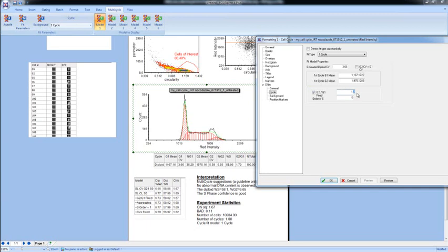We can empirically determine that using a value of 1.6 here, which is what we've done for this data set, results in the best model for this particular data. So this is just something that we put in there to make this data fit a little bit better. You can see how easy it is to actually come in and make these changes to any of these fit parameters. And by doing so, we've actually made this data fit perfectly, and we know that, again, by looking back at the images, that this is where it should be.